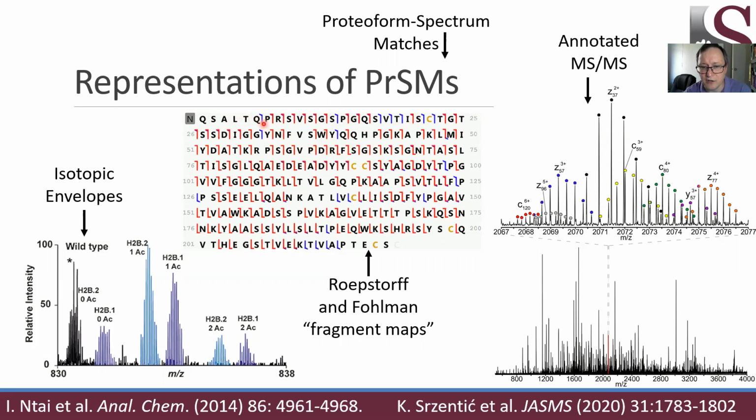And we see all these different amino acids that fall within this proteoform. And we observe that for some of them, an N-terminal fragment has been observed, and for some of them, a C-terminal fragment has been seen. So the N-terminal fragments are either B or C ions. The C-terminus containing fragments are the Z or Y ions. All right, so typically when someone is asking, how much faith should I have that this tandem mass spectrum has been correctly identified? I'm going to do it by visualizing it in a fragment map.